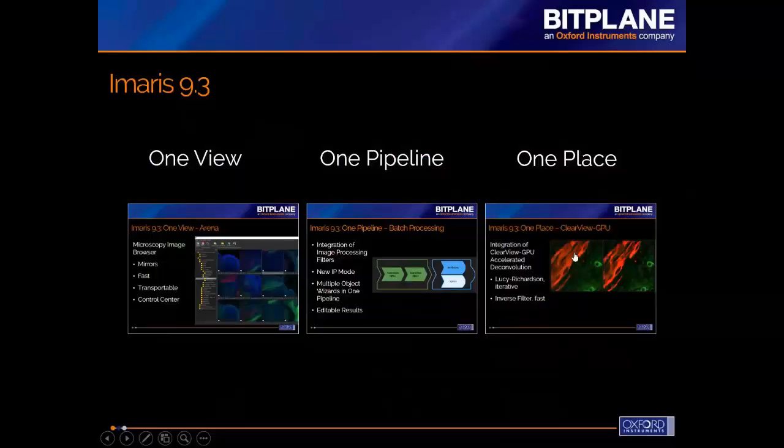When we sat down to think about what we wanted to do for this release and how we wanted to help everyone, the thing that stuck with us after talking to lots of customers and other people out in the field is that each user is generating so much data. They have tens, hundreds, or thousands of images that they're trying to keep track of.